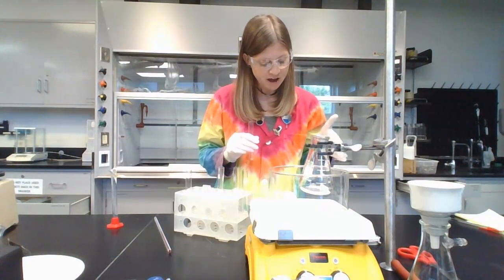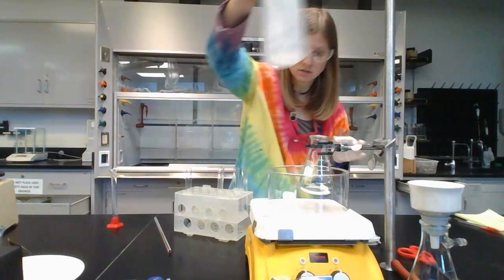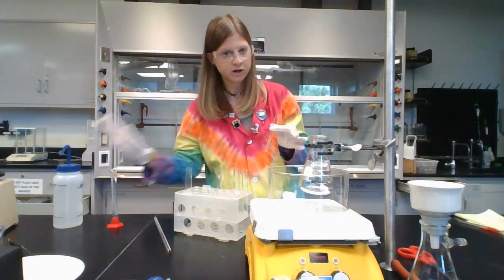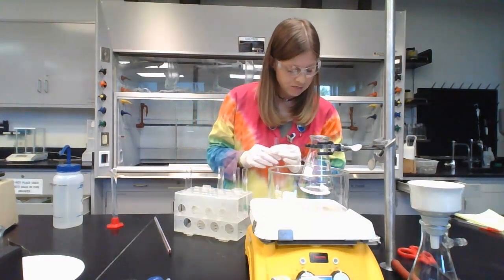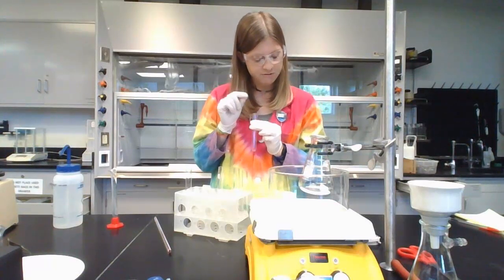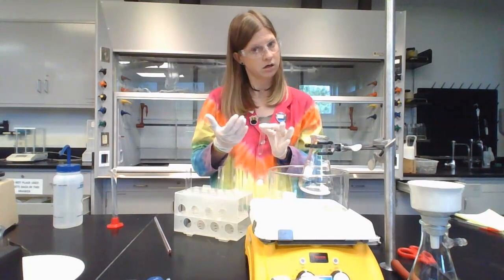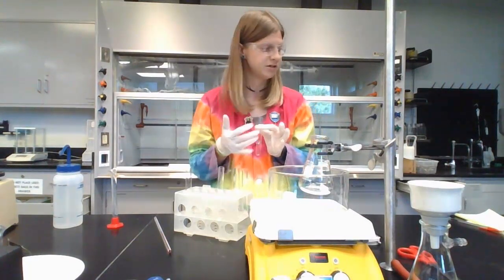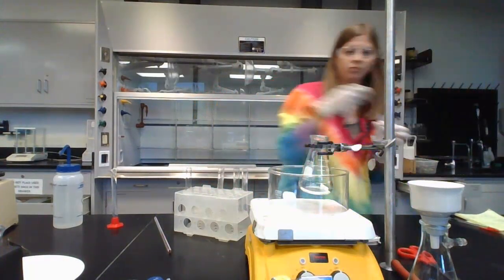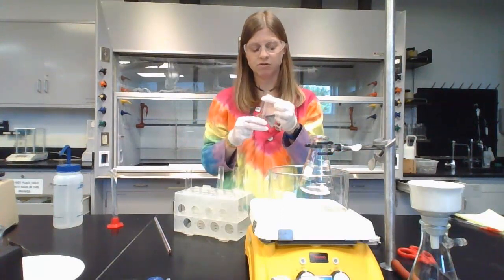And then it says to add 5 milliliters of deionized water. Well, you can just use your squirt bottle for this and squirt in a decent amount of water. You can also measure out the 5 milliliters, but it's really okay. And then you're going to add a drop of a 1% iron 3 chloride solution. So that's the chemical that's going to change color depending on the presence or absence of this phenol functional group. When you do that, you're also going to want to stir it with a glass stir rod to get some of that solid to dissolve.